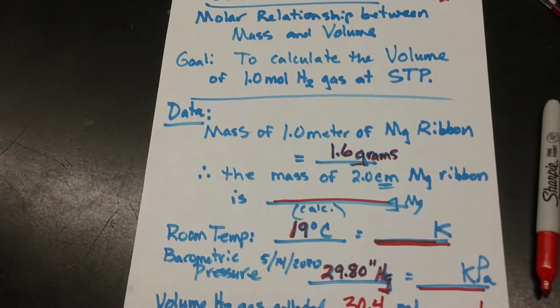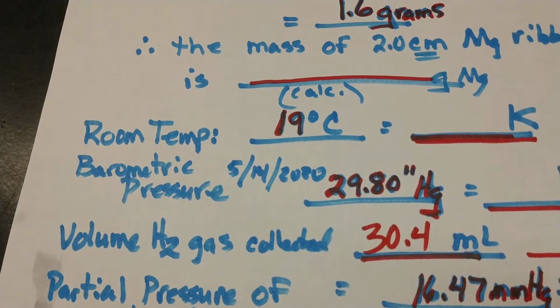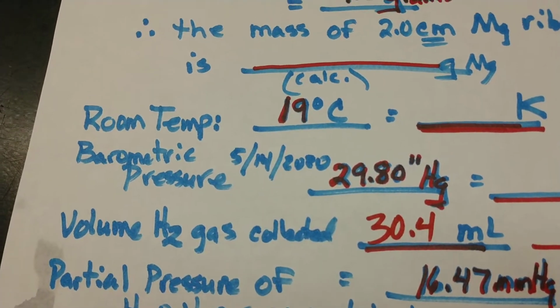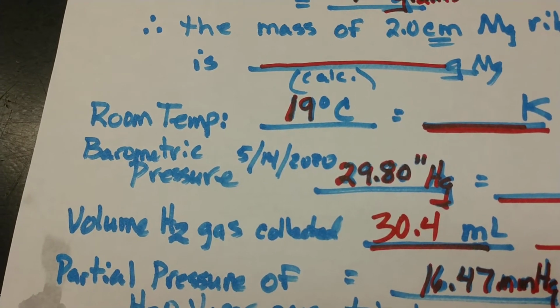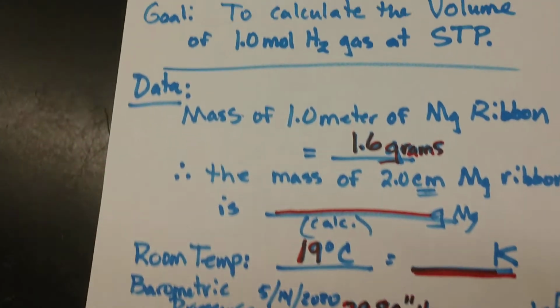So I'm going to come now to my data sheet here, and you can see that I put in red there, the volume is 30.4 when I equalized the pressure to the atmosphere instead of it being 32 as it was in the experiment. I now made that adjustment. So let's go back to the top here.